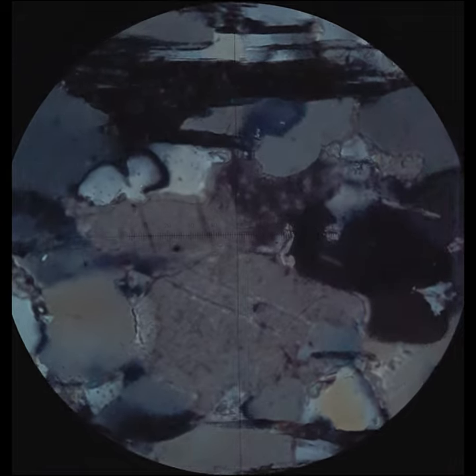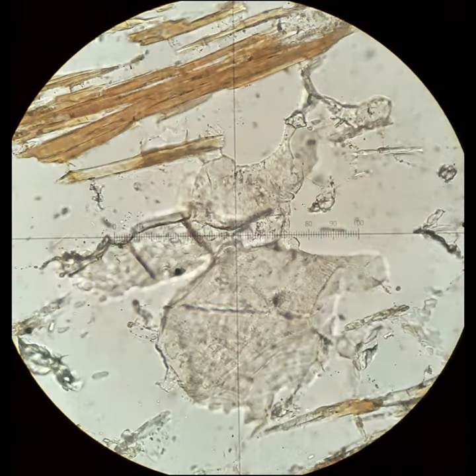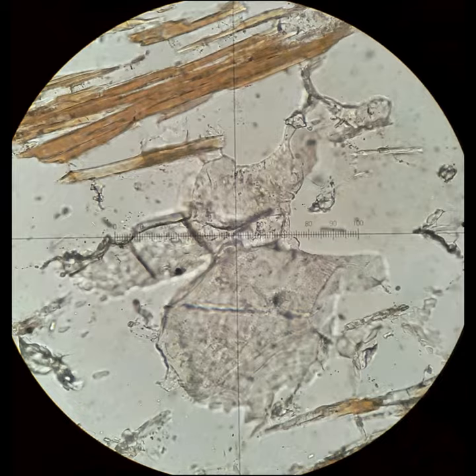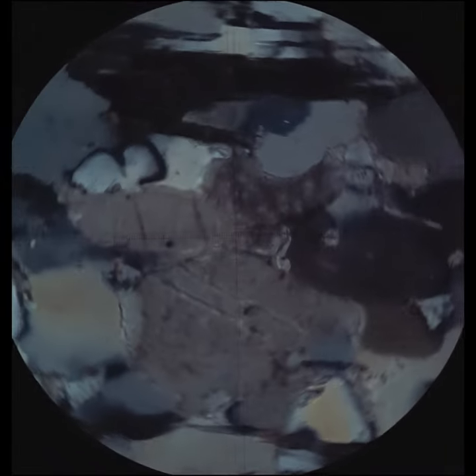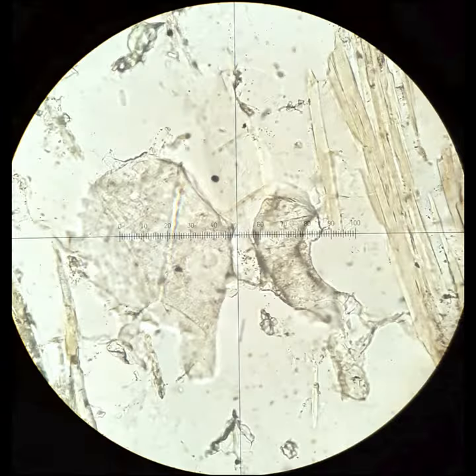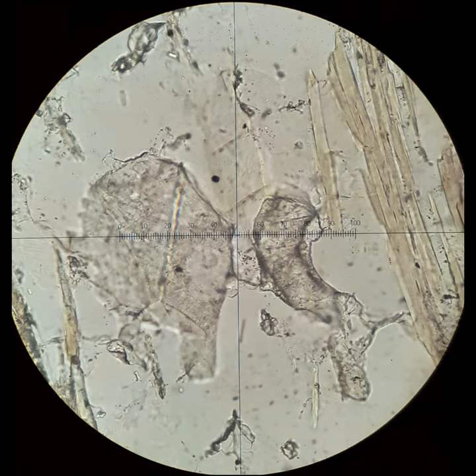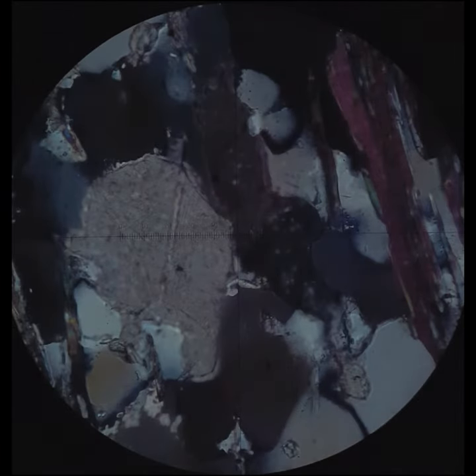Cross the polars, rotate until they're pretty much at extinction. Right is low and left is high. Now rotate it 90 degrees so they're almost extinct — left is low and right is high. It works.